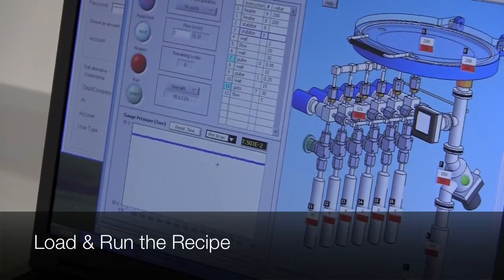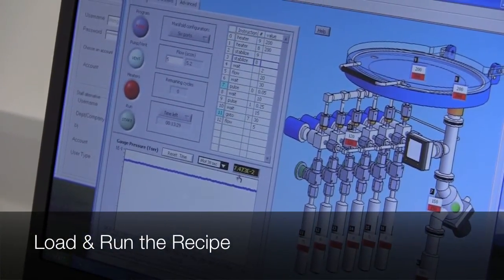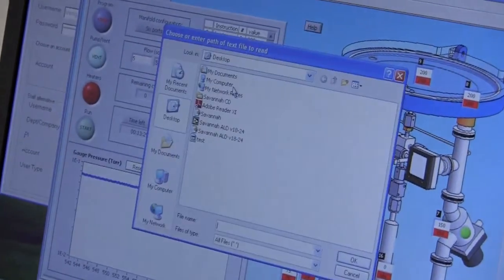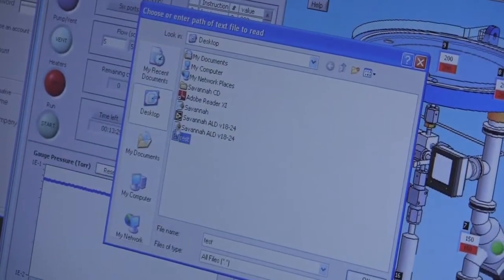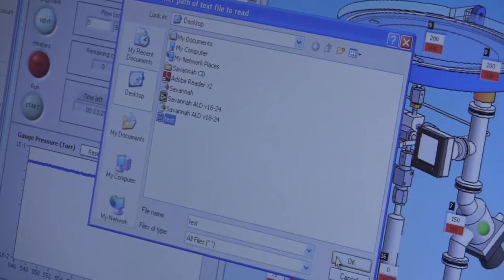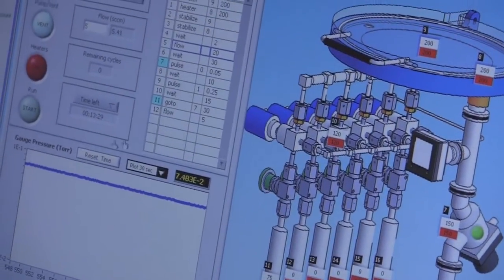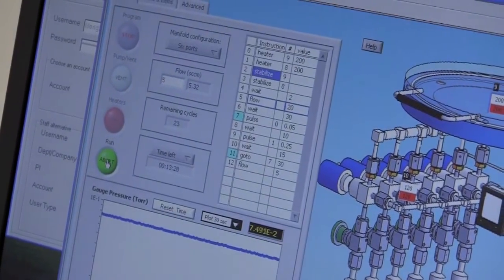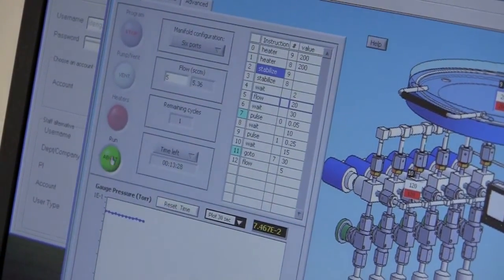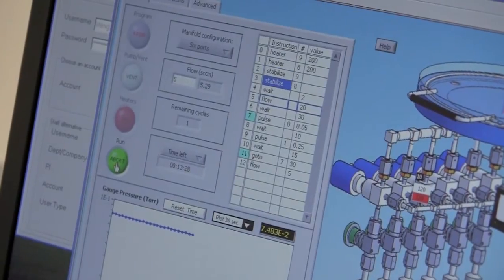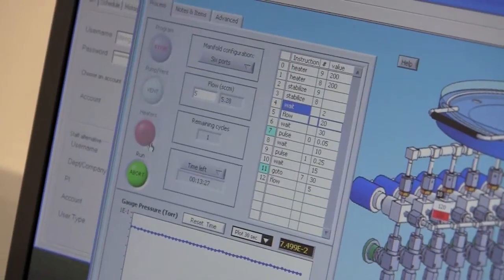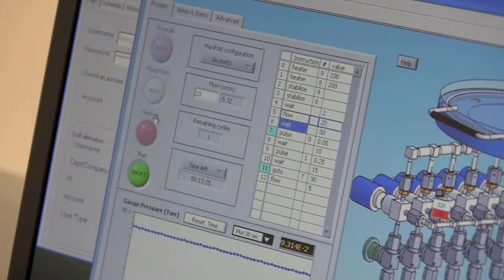When the chamber pressure goes down around 75 millitorr, you right click this area to load a recipe. Pick a desired one. Click OK to load it. Then you click the start button to run this recipe. Now you see this button becomes green and also toggles to abort button. The other three buttons become inactive.